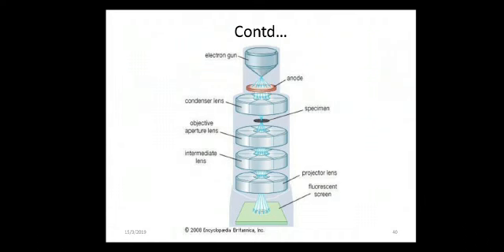So the tungsten electron working principle. The tungsten filament generates a beam of electrons that is then focused on the specimen by the condenser, and the magnetic lenses are used to focus the beam. The column containing the lenses and the specimen must undergo high vacuum to obtain a clear image because electrons are deflected by collisions with the air molecules.